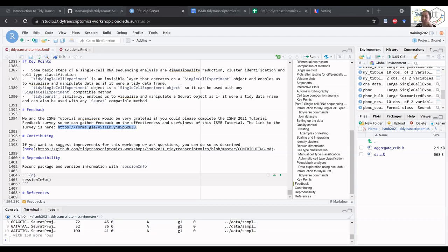But basically, a very empirical way to do it is you can plot the histogram of variance explained by each component, and you will see that it will trace a curve. At the elbow, you have an idea that after a certain number of principal components, you don't add so much information. But there are actually statistical tests that do that quite more quantitatively.